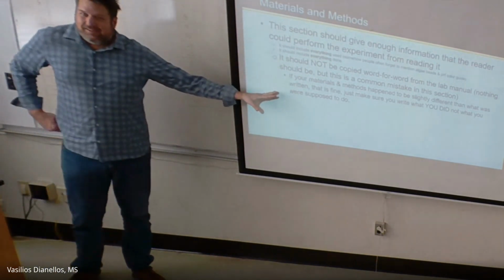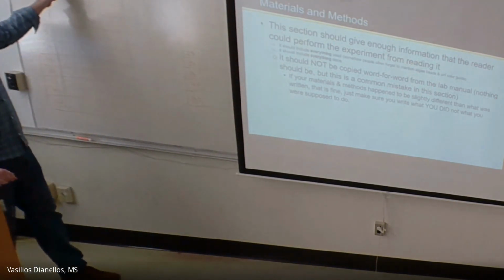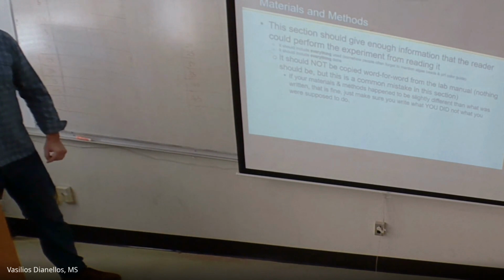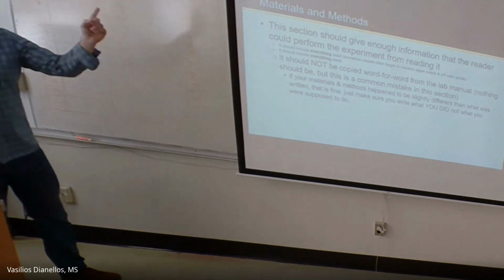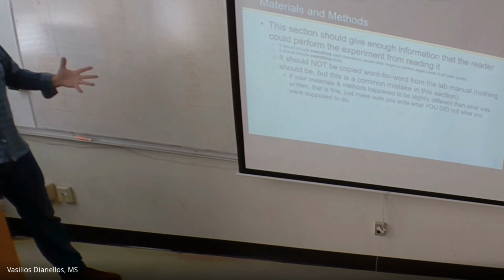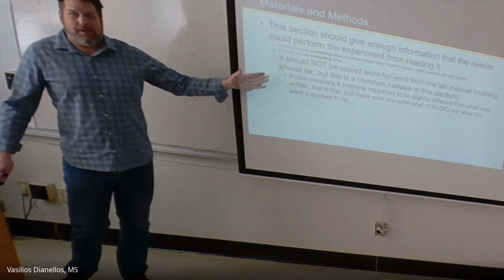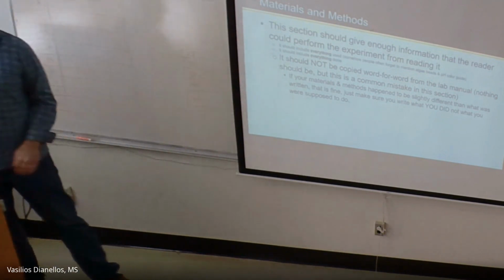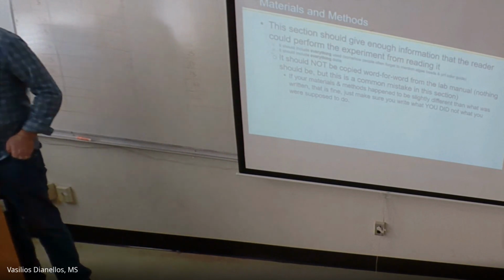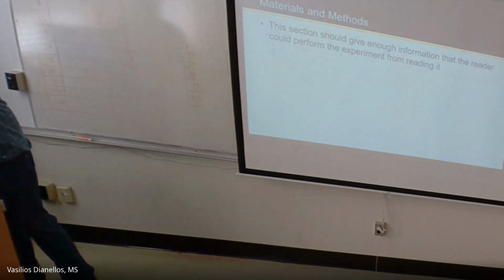Does that make sense? So if the lab manual says, put them at 10, 15, and 25 centimeters, and you say, nah, let's not do that. Let's do 5, 20, and 30 for some reason. That's okay. You can do that. Just make sure you write down what you actually did, not what the lab manual tells you to do. Does that make sense? All right. Because you do have a little bit of freedom. Now, granted, I would recommend talking to one of us before you go making a big change, but it's your experiments.